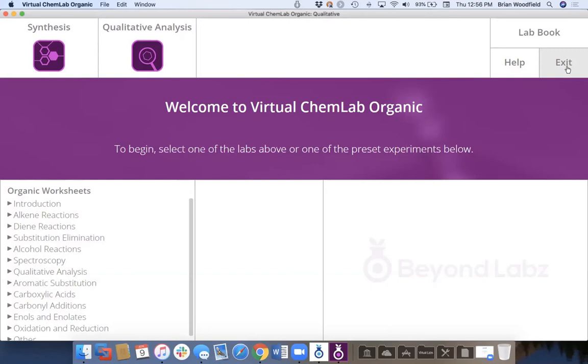You mean the solubility of an organic compound in the inorganic lab? Well, in the inorganic lab, it's all about solubility because we have these different anions to see what's soluble and change the pH. But in the organic lab, no, we don't have a set of solvents that they could add to see if it's soluble or not.